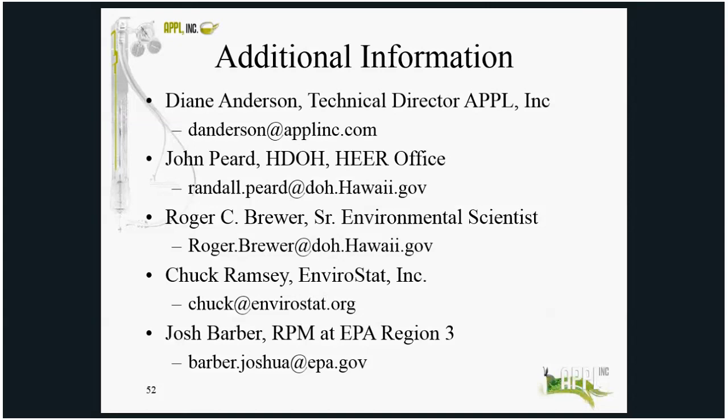And another question, Diane: how common or uncommon is it for you to get over 15 or 20% RSD on your lab triplicates on subsampling? Well, it truly depends on if the sample was ground or not. If the sample was not ground, we will see it much more often than we will on a ground sample.